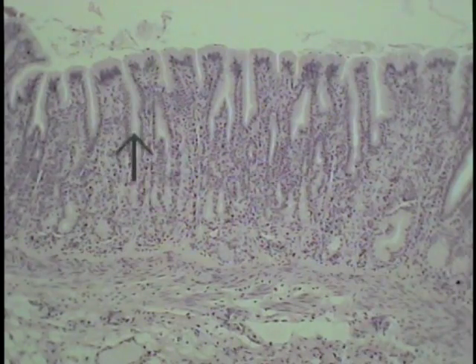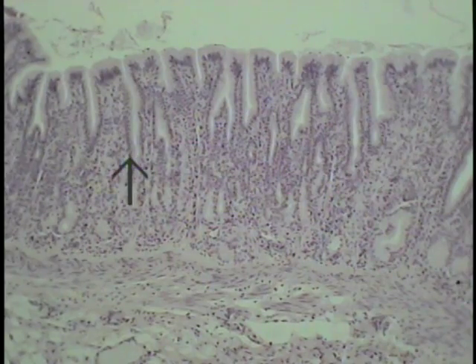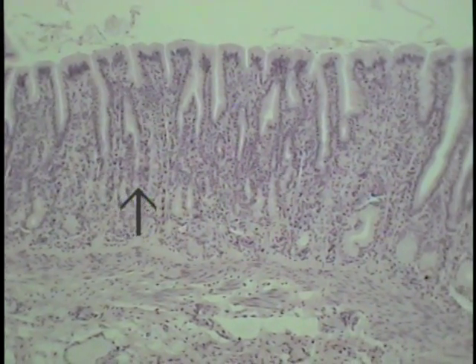In addition to the epithelium, the glands are located within this connective tissue that's sort of hidden around in between the gastric pits and sort of around the glands. So they're invaginated into the lamina propria, which is also present here. It's more cellular in nature. It has other cell types, mainly immunocompetent type cells, as well as a few smooth muscle cells and, of course, vasculature and what have you. But it is obscured somewhat by the development of the gastric pits invaginating down into it, as well as the glands ramifying and twisting around through it as well. So it becomes more hidden or compressed behind the epithelial component that catches one's eye.